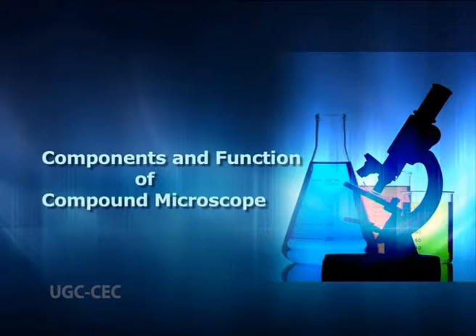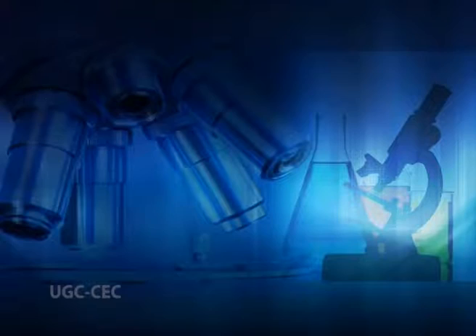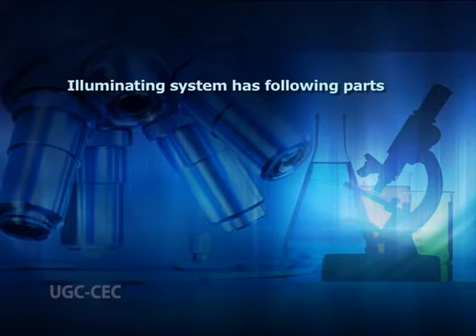Components and function of compound microscope. The main parts of a compound microscope consist of basically 3 units. It includes the illuminating system, the optical system, and the third, the accessory supplementary system and documentation. Let us go through it in detail along with their individual functions. The illuminating system has the following parts.